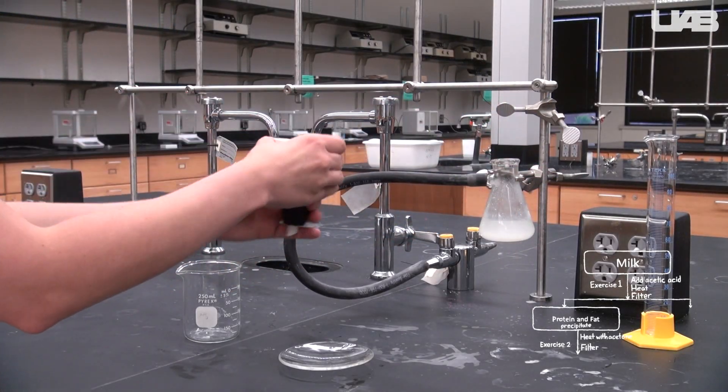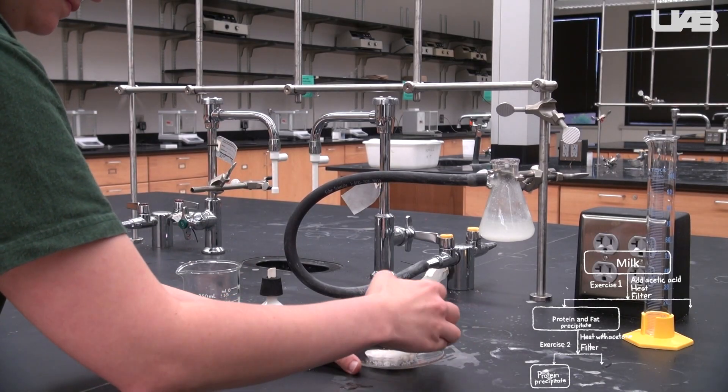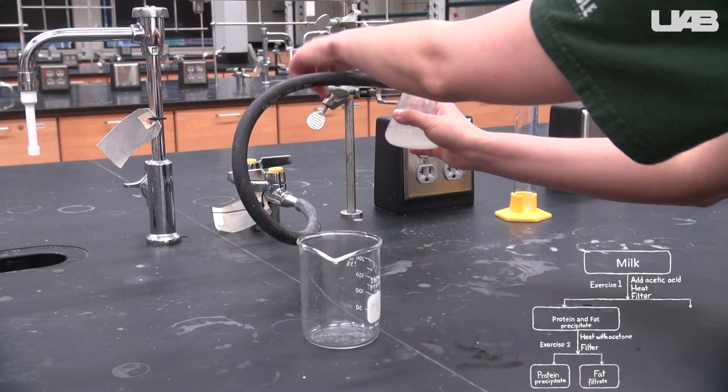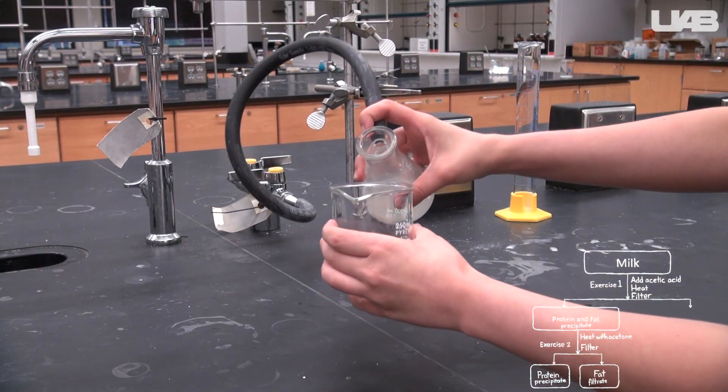Snap off the top part of the funnel and flip out the solid onto a watch glass. Peel off the filter paper. Remove the flask from the clamps. Use caution during this part because the rubber tubing can easily tip the flask over.